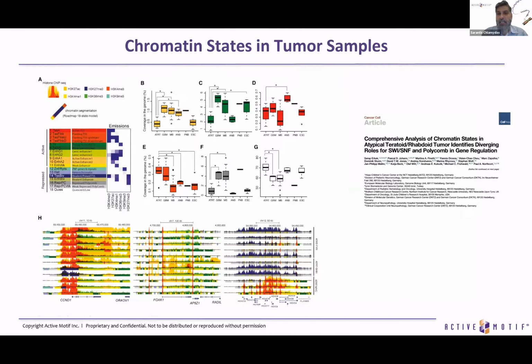It's a really aggressive infantile tumor, and the scope of this collaboration was to identify specific epigenetic profiles of the patients in order to design targeted therapies. We tried a combination of open and closed chromatin marks, and as you can appreciate from the different color codes, we are able to stratify patients and help scientists later on to design targeted therapies.